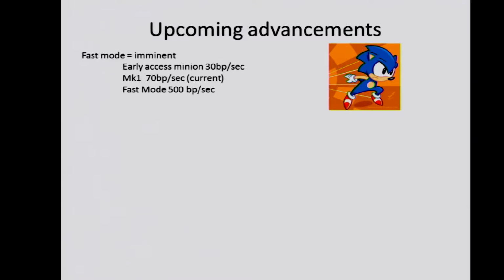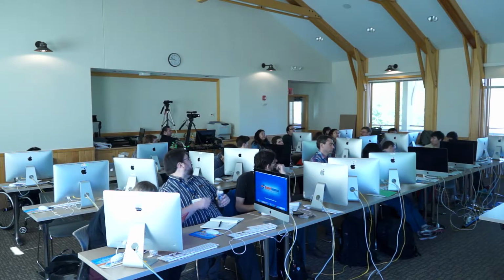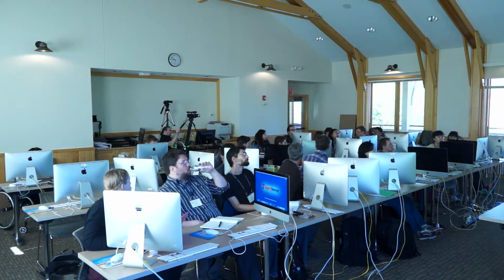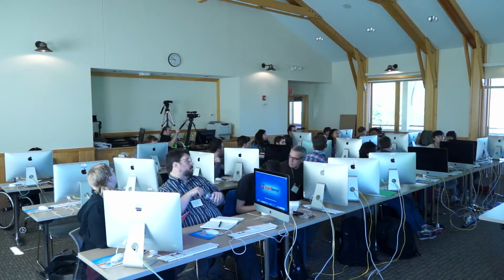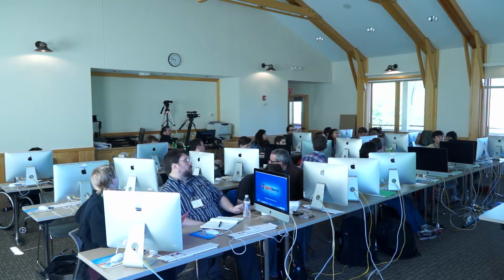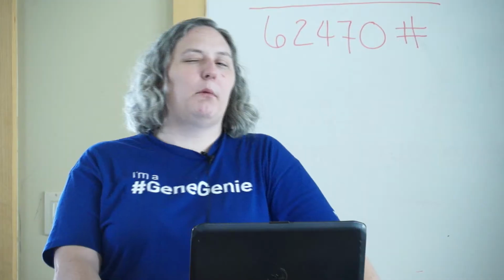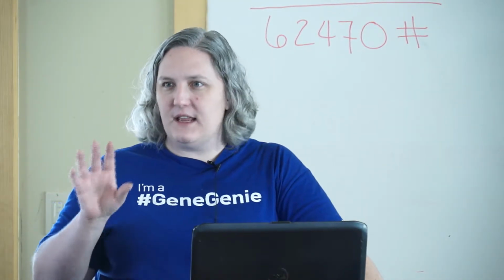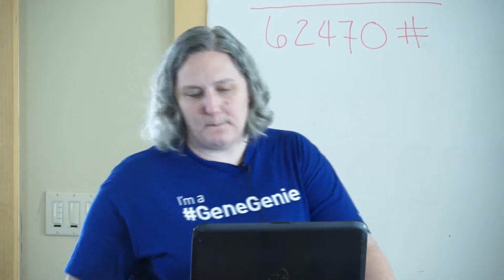Yes, absolutely. Yes, I just want to ask, when you come around the hairpin and are going back on the other side, I assume that there's some sort of algorithm that knows you are opposite the base from the other. Actually touch on that probably after the break, on kind of the data structure and what's really in these files and the hairpin structure there as well.